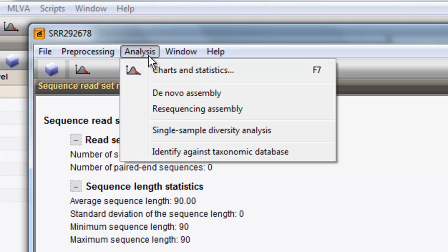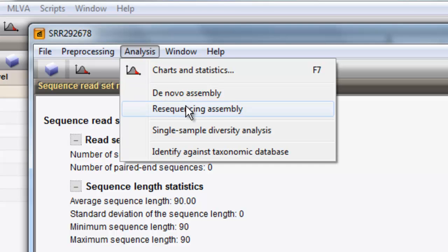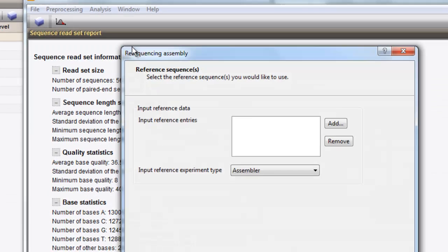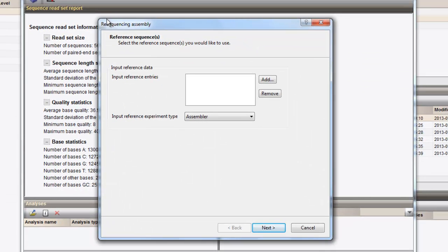In this analysis, we use the resequencing assembly pipeline. A dedicated wizard will query for the parameters used by the assembly algorithm.